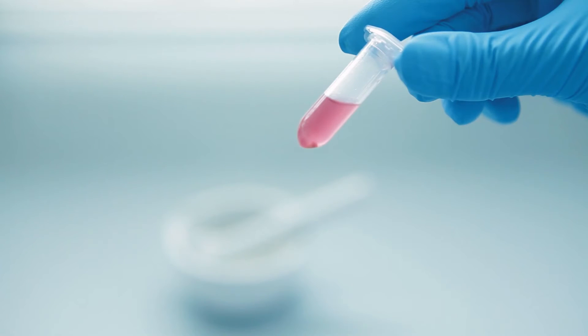For example, it can remain trapped in the sample due to insufficient homogenization. This is particularly an issue with tissue samples.